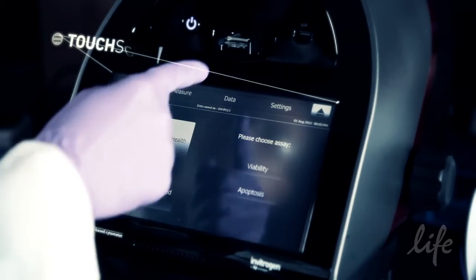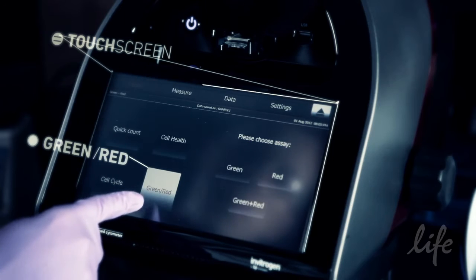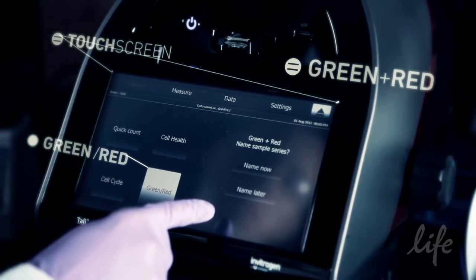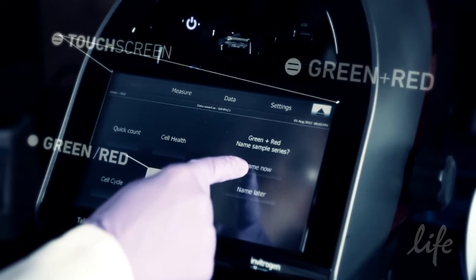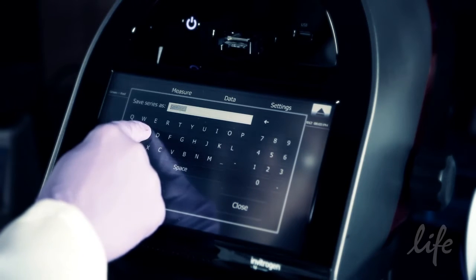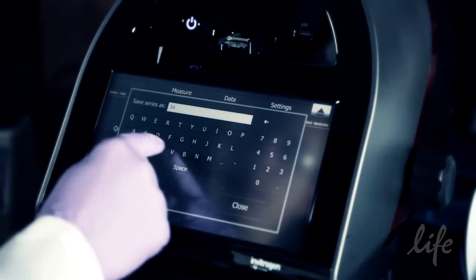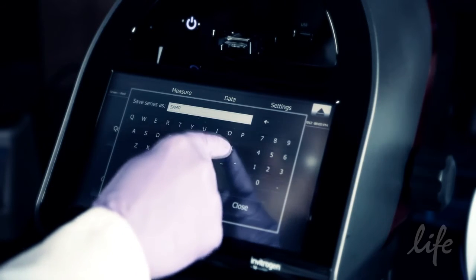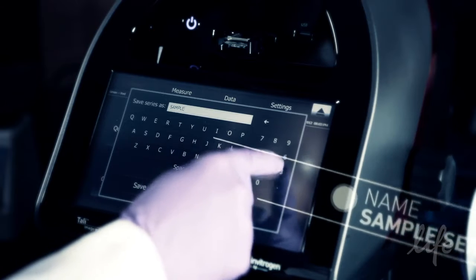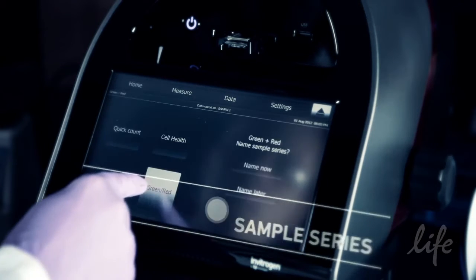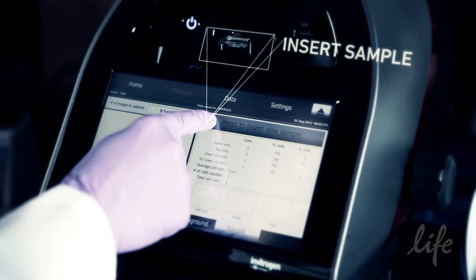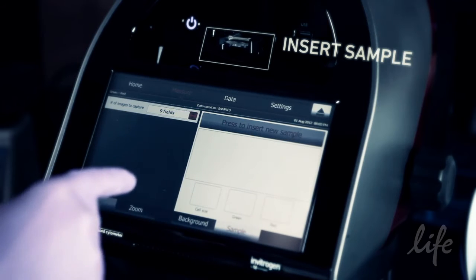Use the touch screen — touch green or red, and then the green plus red buttons. In this assay, green represents GFP while red represents propidium iodide. Follow the prompts to name your sample series. You can name the samples now or you'll have opportunities later. Then touch the press to insert sample button on the screen.